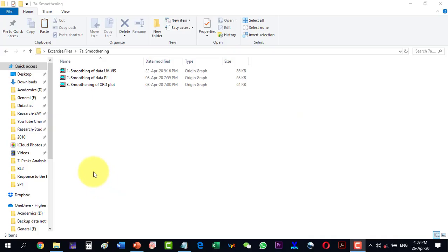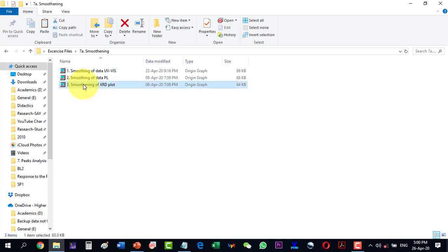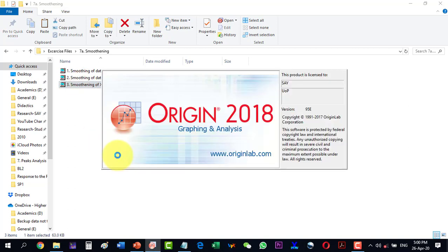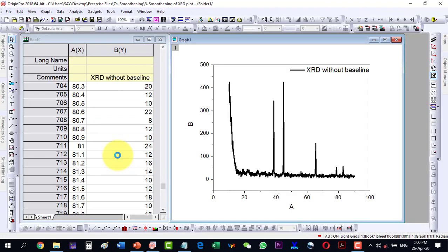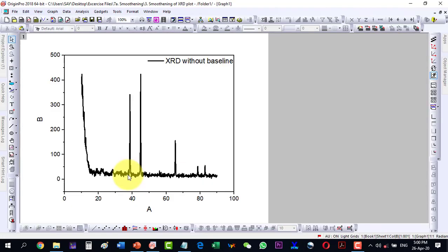In this video, we will talk about how to correct an XRD plot and how to smooth it. So let's start with an XRD plot here. Let me zoom it.